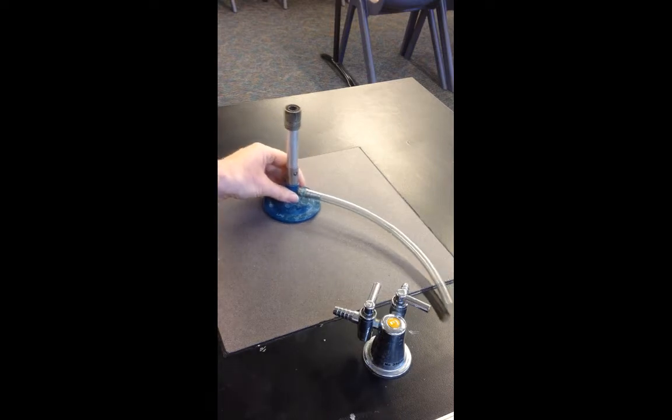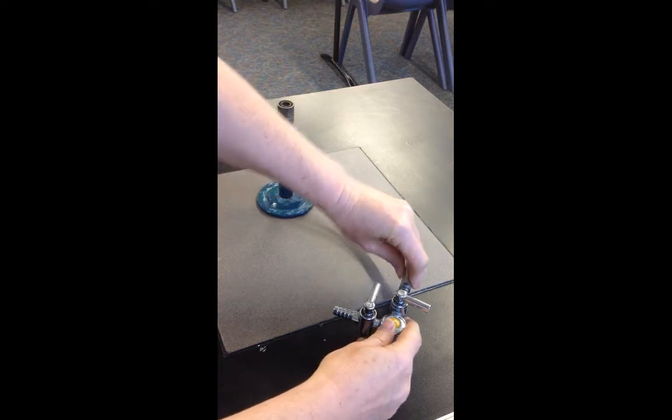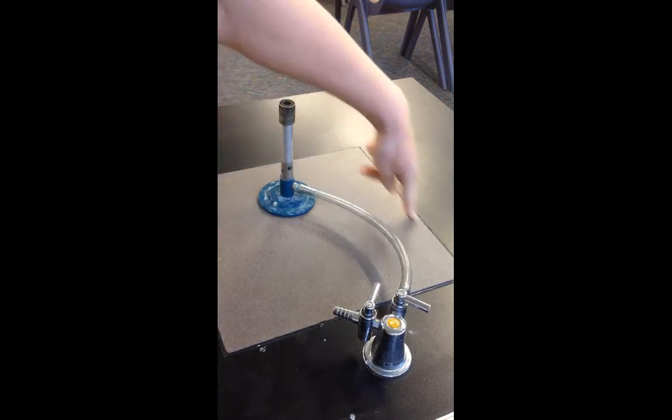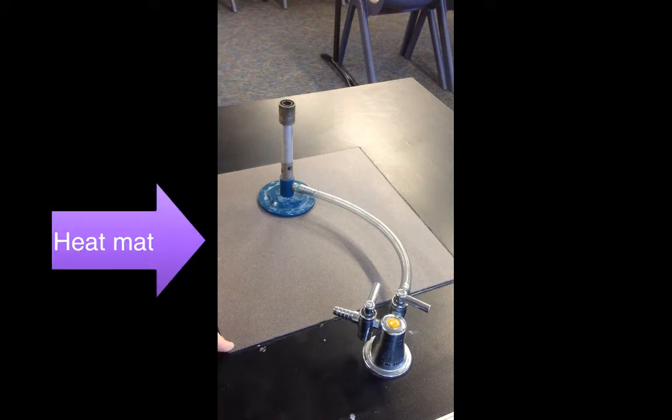To connect the Bunsen burner, you attach the tube to the gas jet nice and firmly. You make sure that the Bunsen burner is sitting on the special square on the desk that's going to protect the desk from the heat coming from the Bunsen burner.